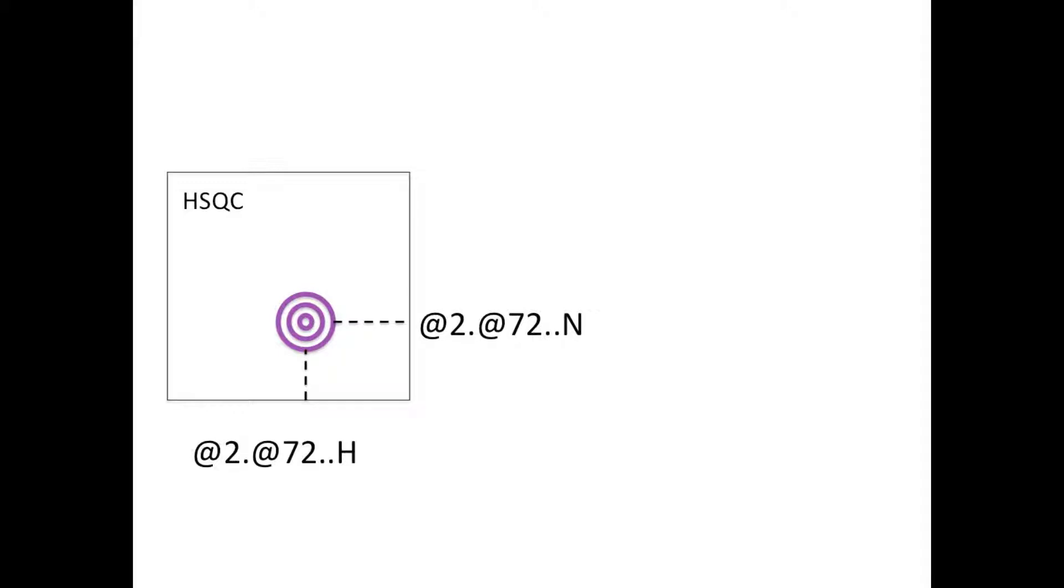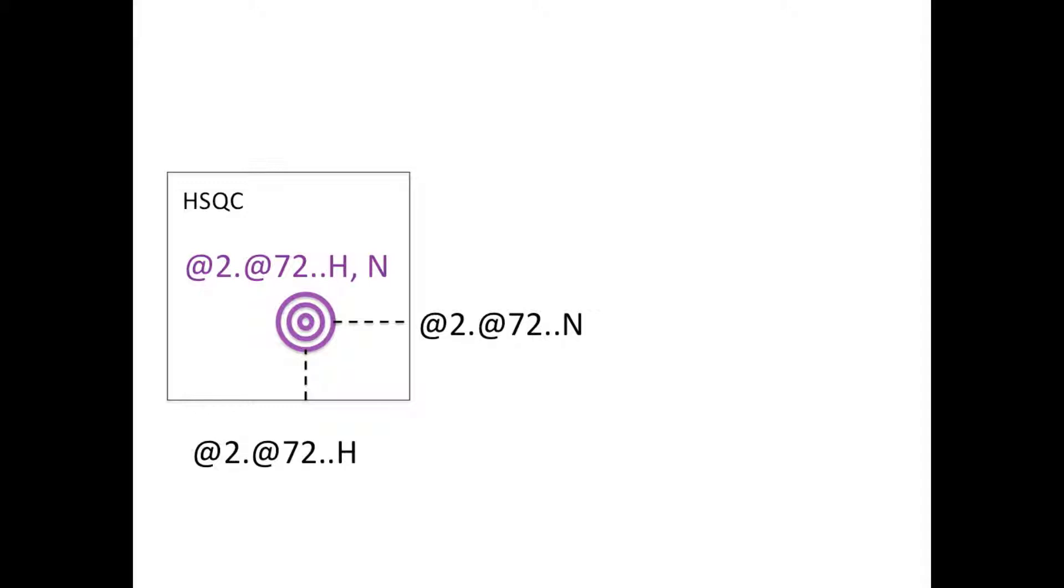Of course, the HSQC spectrum is such that we know that those two atoms have to be bonded to one another and belong to the same residue. Therefore, the NMR chain and NMR residue numbers are the same for both dimensions, and only the NMR atom names differ. Analysis would typically abbreviate the peak label for such a peak to at2.at72.h,n in order to save space.